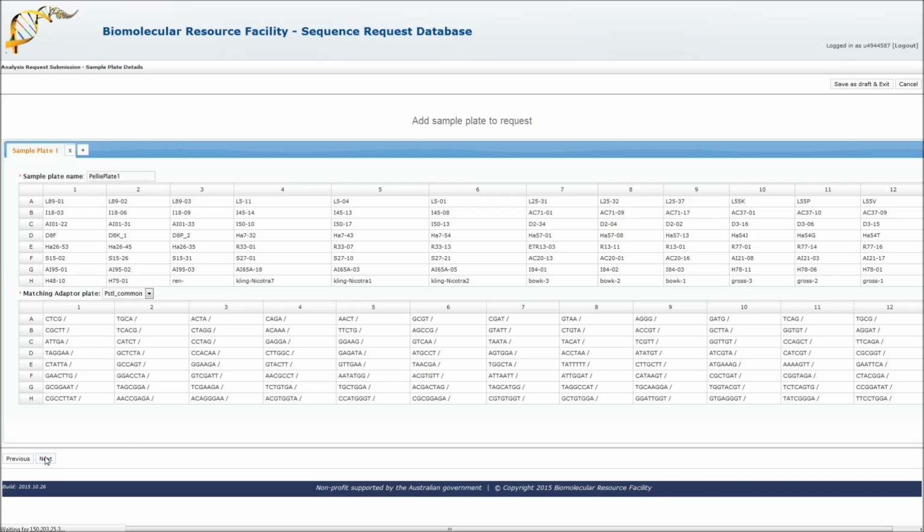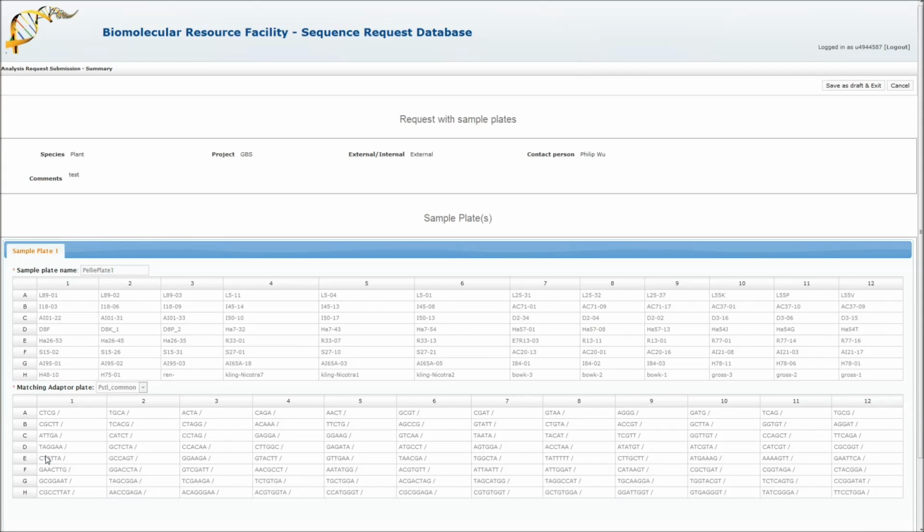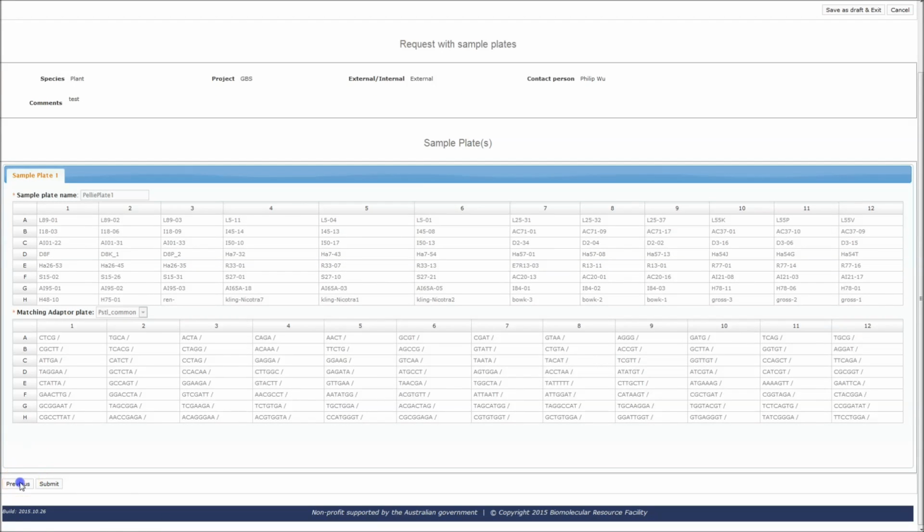We can click Next to review our submission. In this case, I forgot to add a second plate, so let's go back and do that.